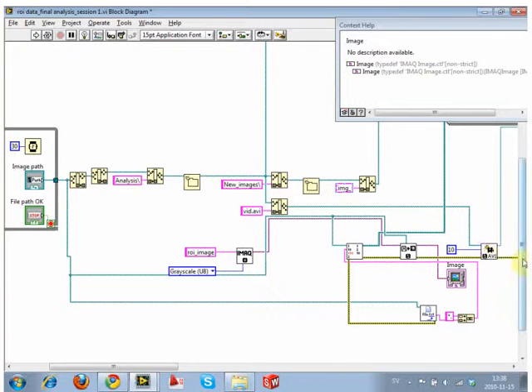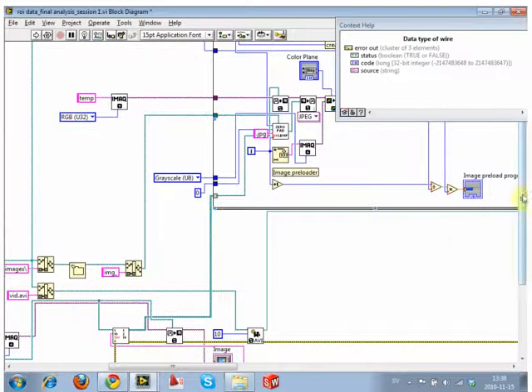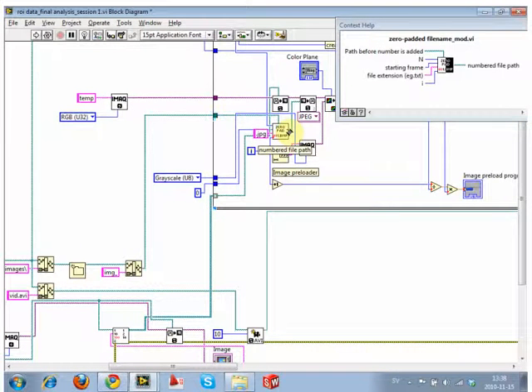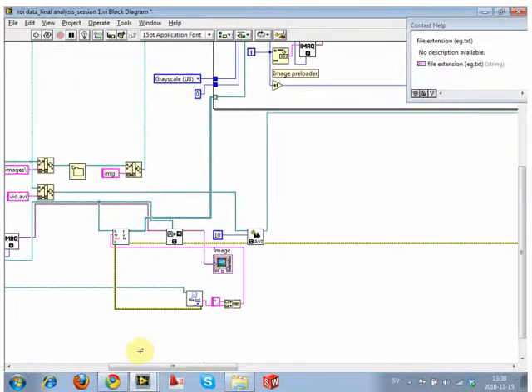One other thing while I'm thinking about it. Our ZeroPad file name extension looks for a file extension in it. It needs to know because it builds your own file names for you, it needs to know what you want to call it. So we need to add the same thing up here. And since we're automating these things, rather than write this explicitly, we want to use the same information that we're getting here. So we want to duplicate this.